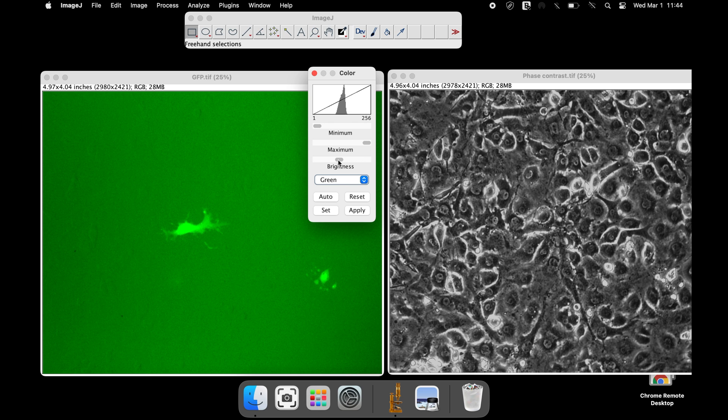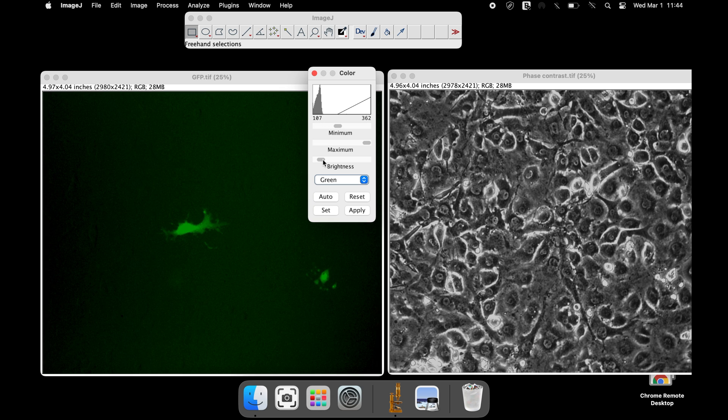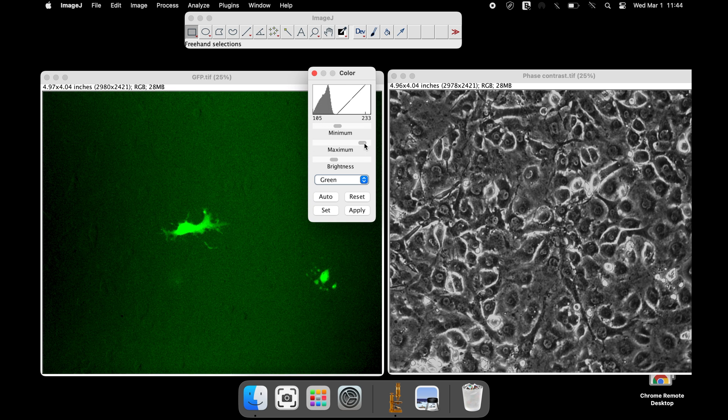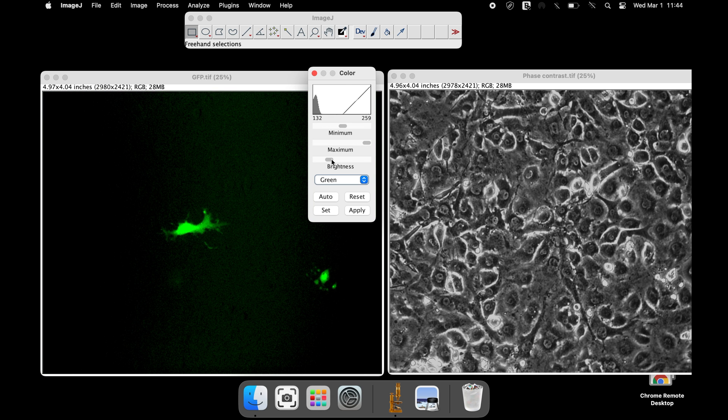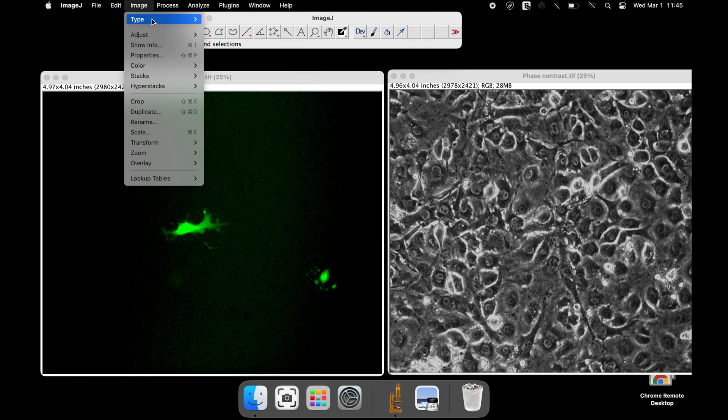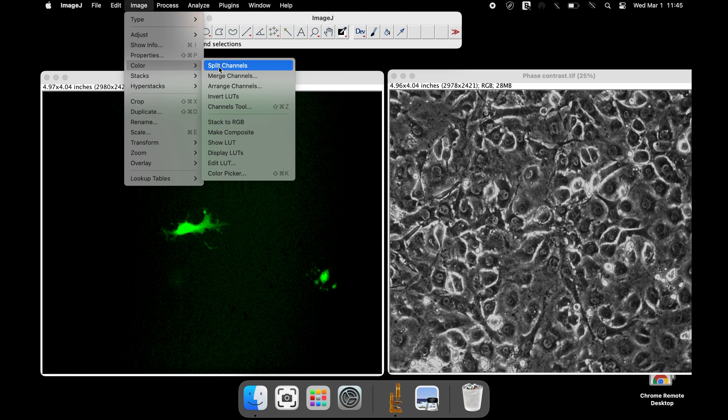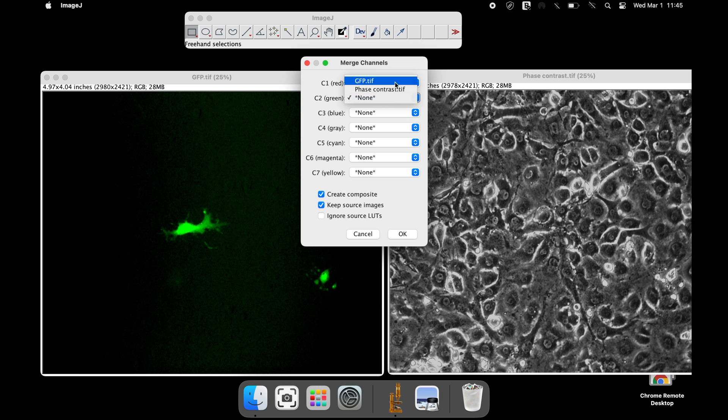Once the modification is completed, these images are ready to be merged. Click on Image, Color, and Merge Channels. From the Merge Channels window, select the GFP image as C2 green and the phase contrast image as C4 gray. These options can also be checked if required. Once completed, click OK.